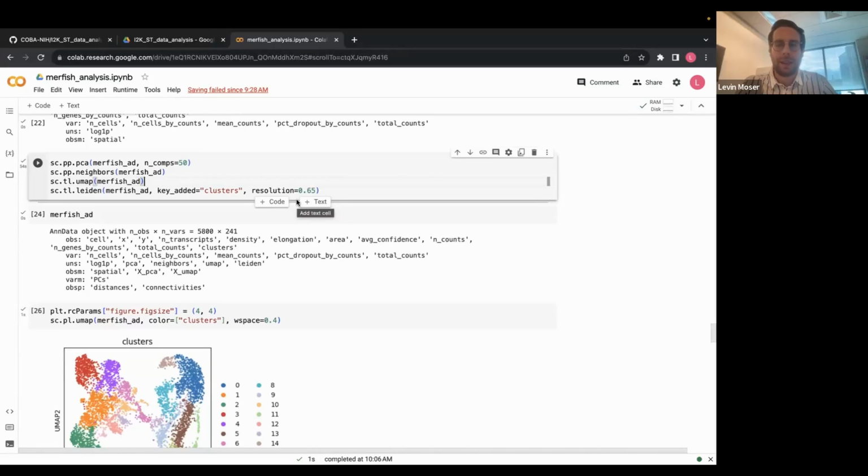However, when you do PCA, first of all, I think it doesn't have parameters, right? But also you know what it's doing. And with all these other clusterings, I'm actually not sure about Leiden, but for sure with t-SNE, there's a lot of randomness in it, and you need to be very careful with these clustering algorithms.